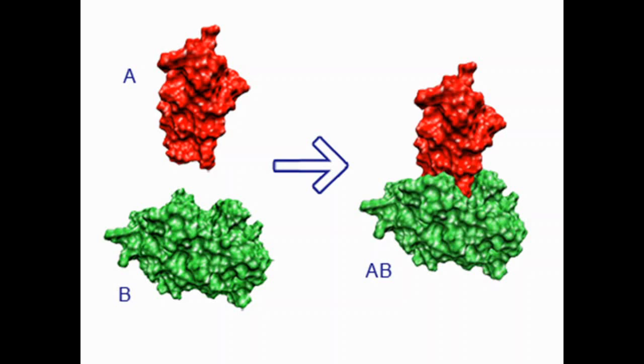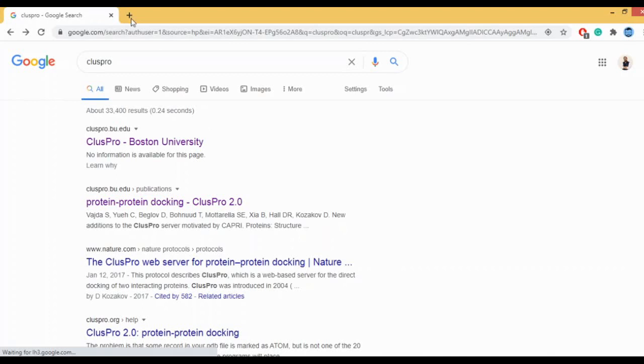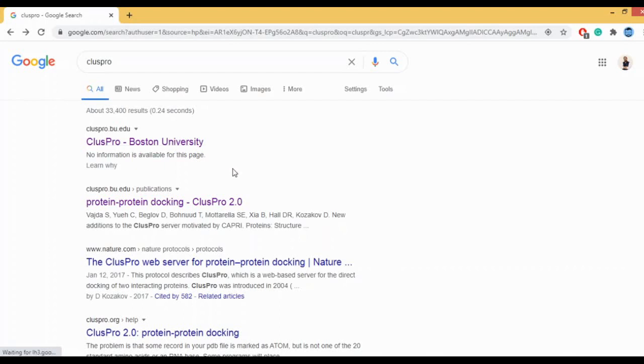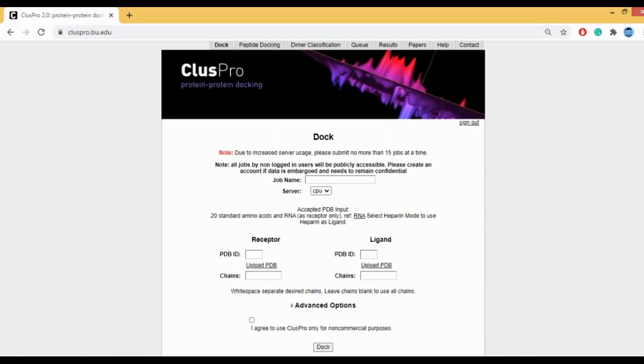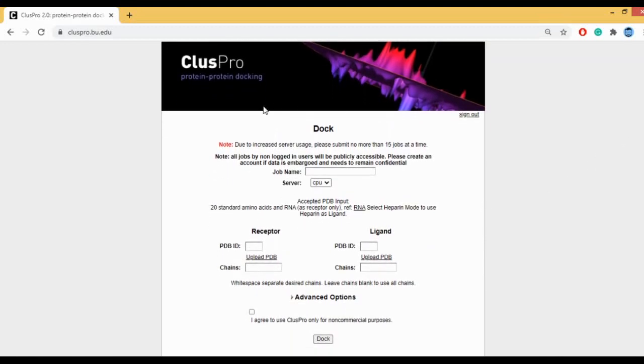Today we are going to look at ClusPro, which is a Protein-Protein Docking tool. ClusPro is a web server for Protein-Protein Docking, created by Boston University. When you click on the first hit, it takes you to the ClusPro Protein-Protein Docking interface. This is the web page of ClusPro.